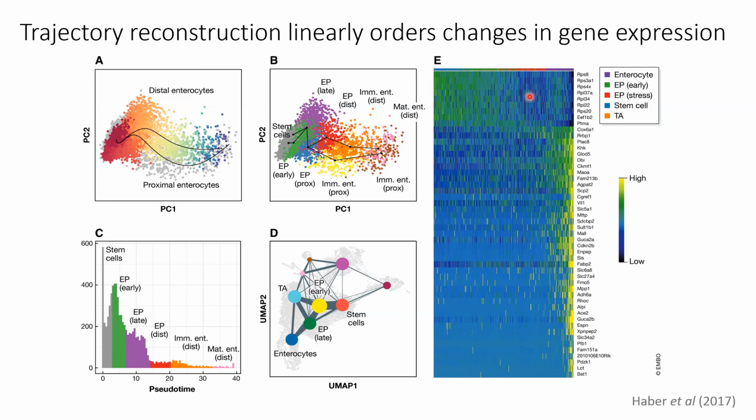Sorry, this cluster. And while many pseudotime algorithms exist, they all mainly suffer from this major issue that assumes linear changes in gene expression patterns over the developmental manifold. So if there exist dynamical patterns in gene expression that are not linearly correlated to each other, such as an increase and a decrease, and then an increase again of different genes, this cannot be recapitulated by pseudotime.